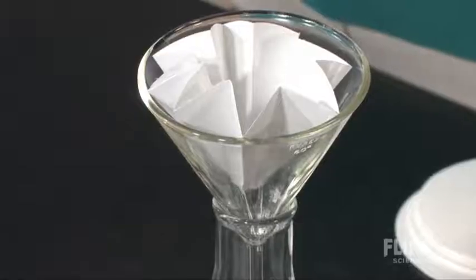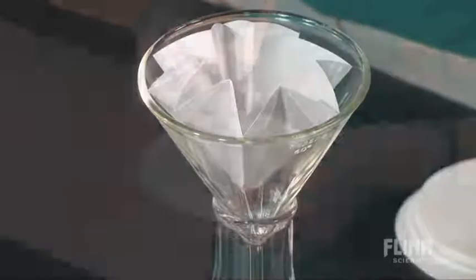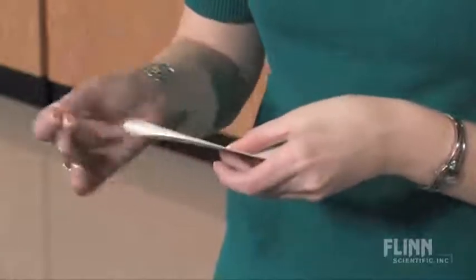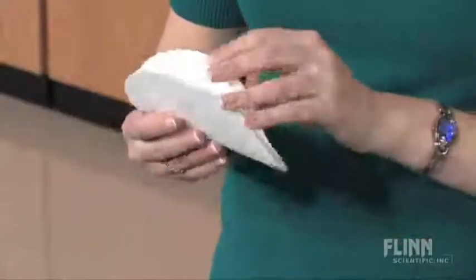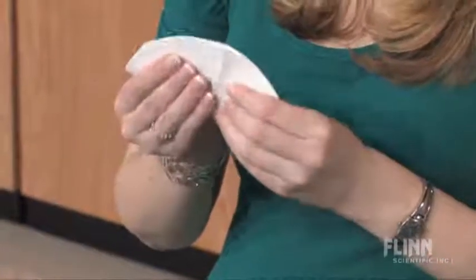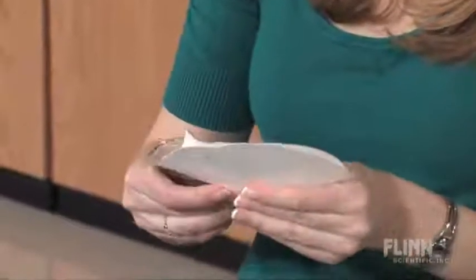Fluted filter paper is easy and fun to prepare. Start with a piece of round filter paper and fold it in half. Open it and fold it in half again, with the outside crease facing the same way, creating quadrants.